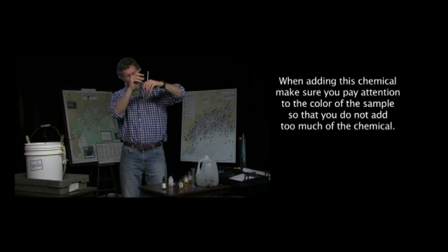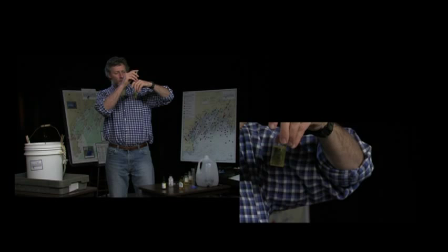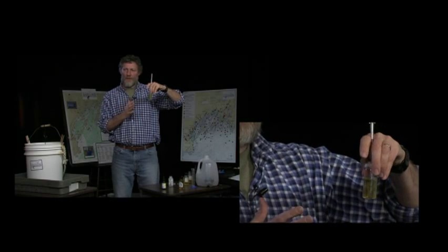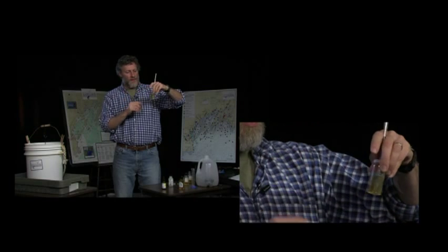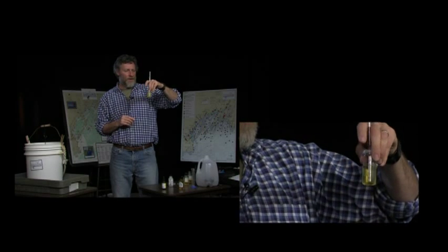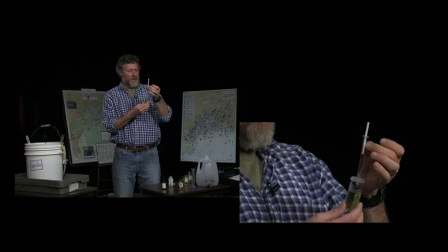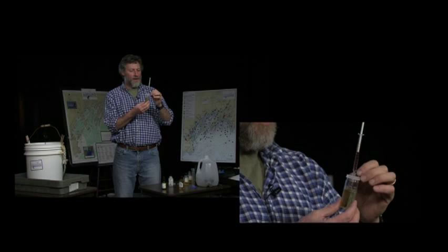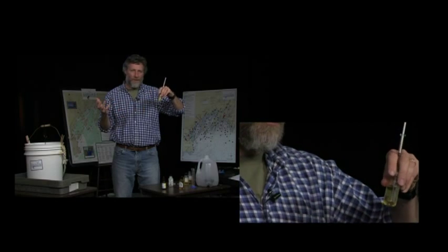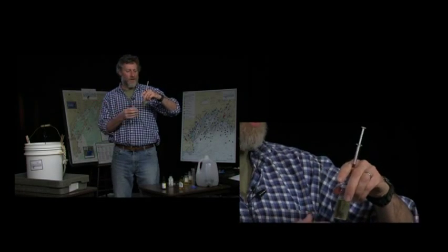One of the things to remember when you're doing this titration is seawater can hold more oxygen in it when it's colder than it can when it's warmer. So when we're doing our testing, our season begins in April and ends in October. Those early months of April and May tend to be pretty cold water. So it's not uncommon that your results for your dissolved oxygen tests will be greater than 10. And the scale on the syringe here is 0 to 10. And you will find that you've put all the thiosulfate into this titration tube and it hasn't gone clear, and some people think, well, did I make a mistake? Did I screw something up? Well, you haven't. It's telling you that there's more oxygen in there than 10.